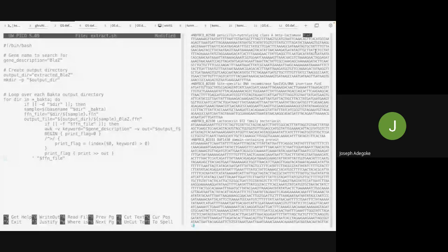So the unique symbol, the gene name, is always unique. No other gene has it. If there are variations, we put it there as underscore something number or underscore something, but we ensure you have your unique symbol. So we have our unique symbol here.